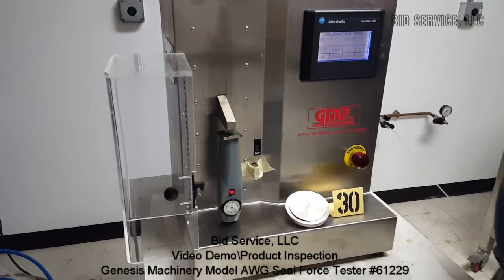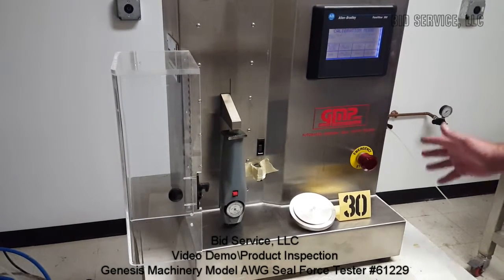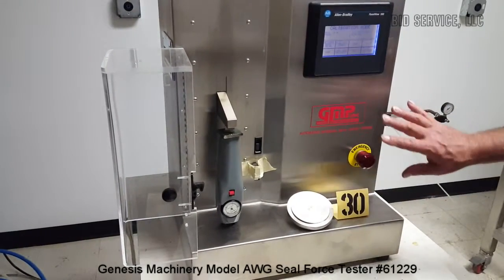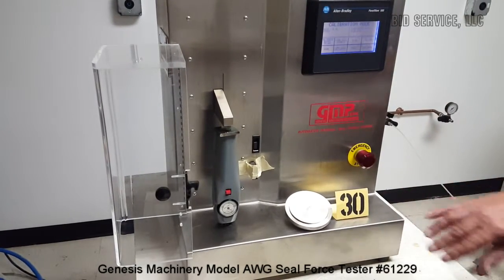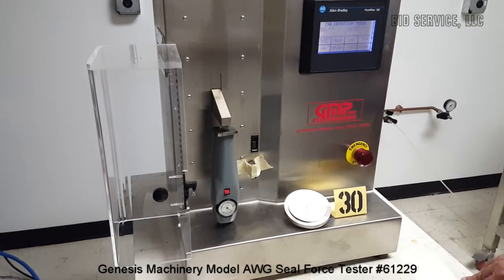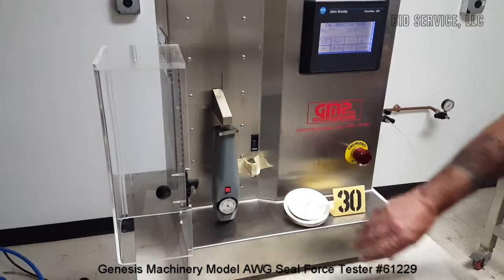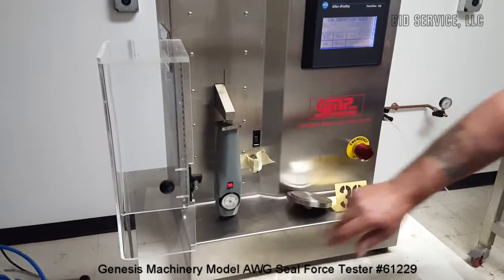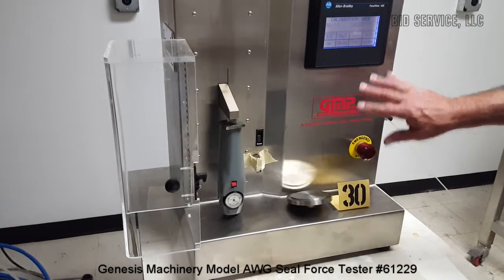This is the Genesis automated residual seal force tester, model AWG. Power has been applied and I've gone into the calibration screen, which is available when you power it up. If you go into run mode the calibration function goes away; you can restart it by hitting the emergency switch and resetting it. In this mode the calibration availability will be there. I've disabled the safety interlock so you can see the operation better — it's already been set up and calibrated.